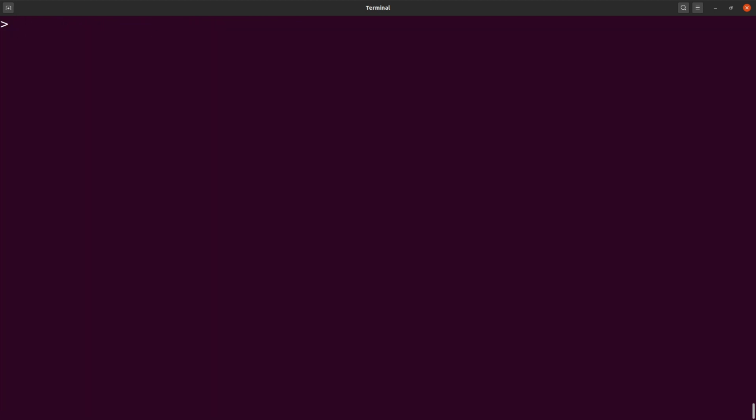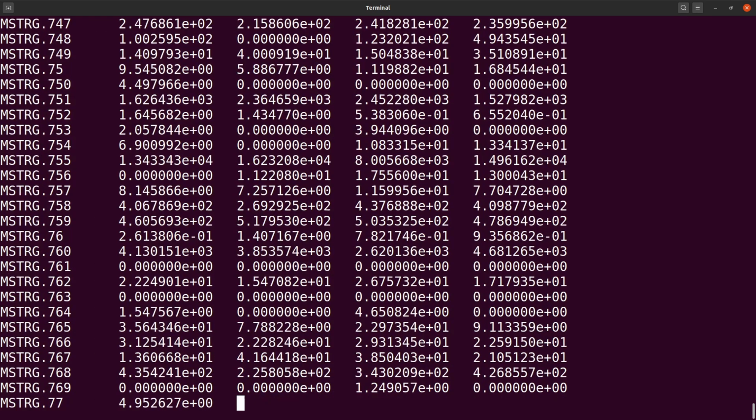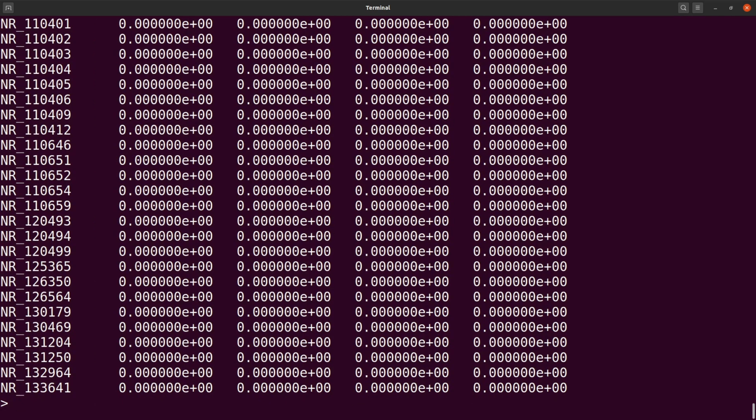Let's proceed. If you are interested in the genes themselves, then you can say gexpr, and then we have it this way, and then you run it. That also gives you the gene expression levels. So you can look at the transcripts or you can look at the genes or other information. Just know what you want and then use the appropriate commands for it.